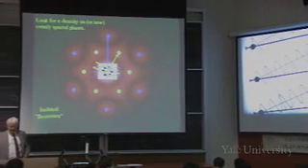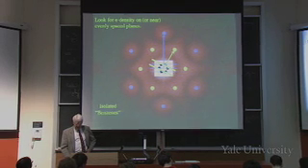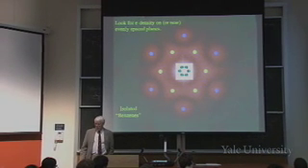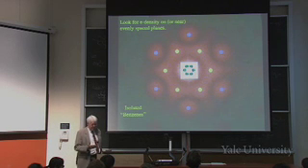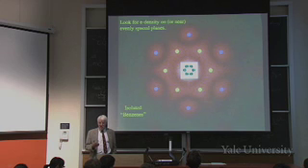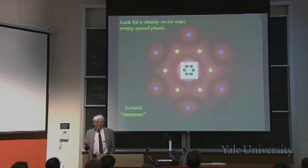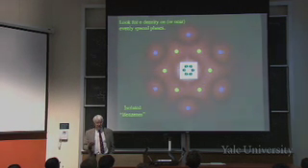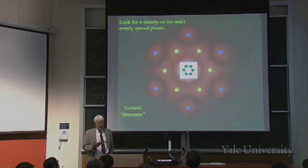Okay, so we get a set of 6 dots like that, and that's most of the pattern. But there are other places too you can see it. For example, you can take those lines. In that set of lines, every dot, the center of every dot is on a line. There happens to be a line in the middle that doesn't have anything on it. But who cares, right? The others are on evenly spaced lines, right? So they'll all be in phase. Where will that one come? That reflection, close in or far out? Far out, and there you see it, way out at the edge.